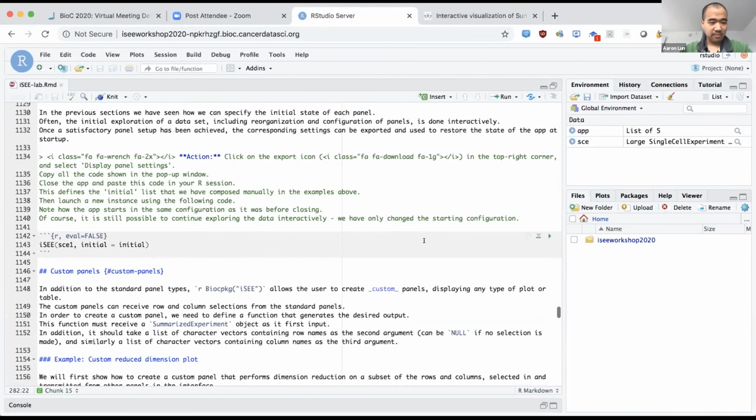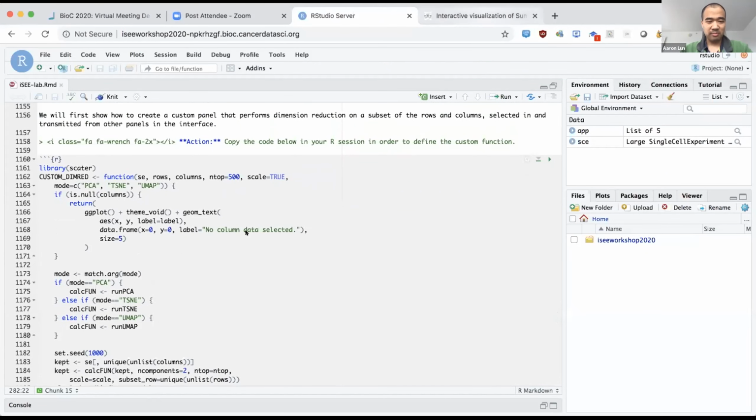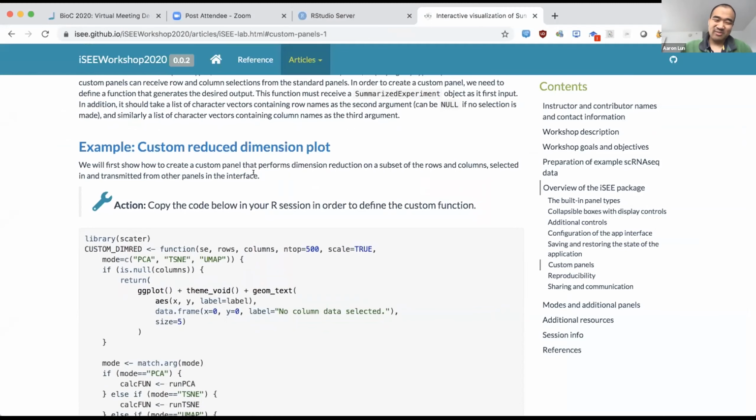So one example here, where am I? One example here is, for example, in this case, maybe I'll show this. This is a bit nicer. One example, yes, the formatting is nicer. Yes, where was I? Yeah.